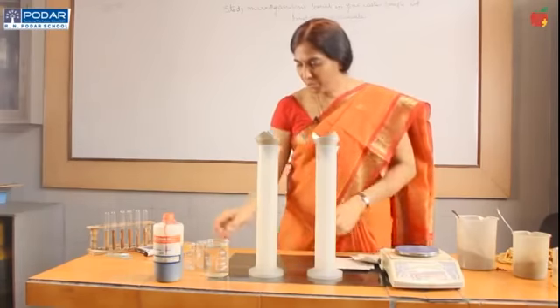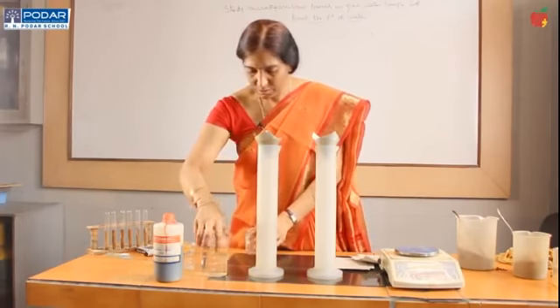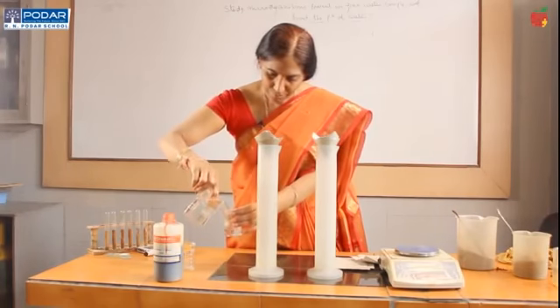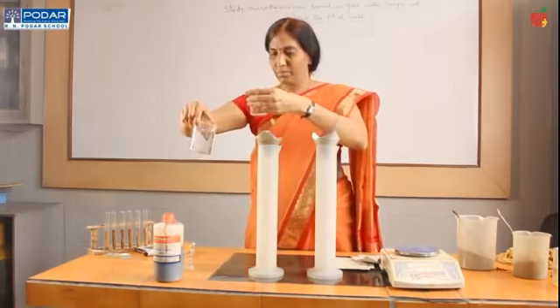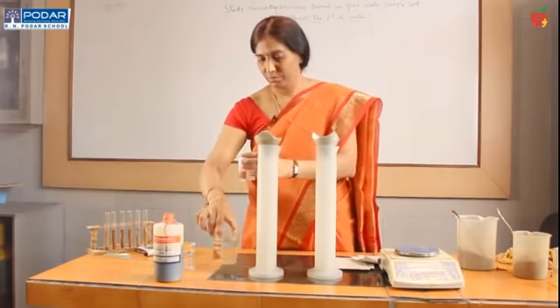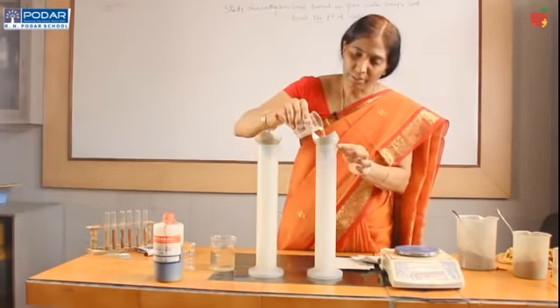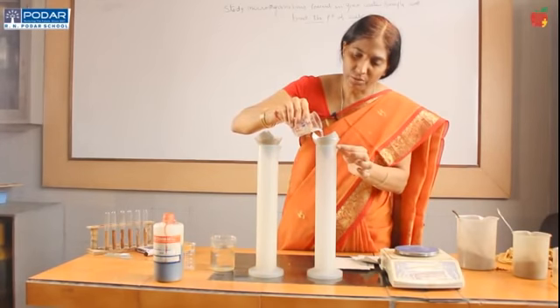Now, I have taken an equal amount of water, that is 50 ml, and I am pouring 50 ml into these two cylinders.